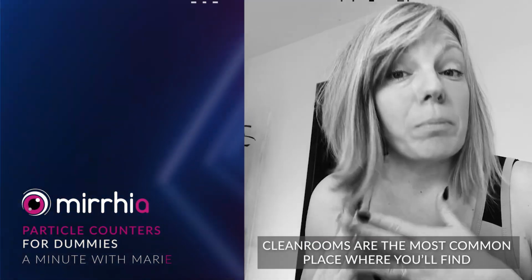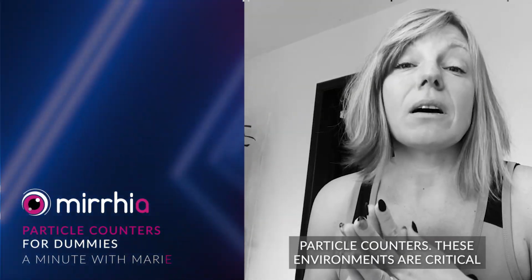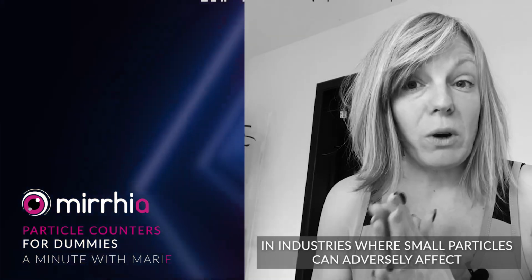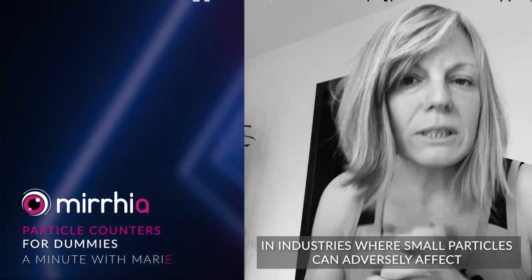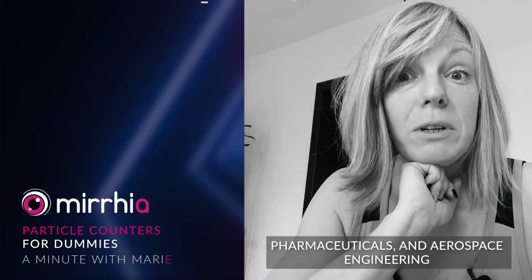Clean rooms are the most common place where you'll find particle counters. These environments are critical in industries where small particles can adversely affect the manufacturing process, such as biotech, pharmaceuticals, and aerospace engineering.